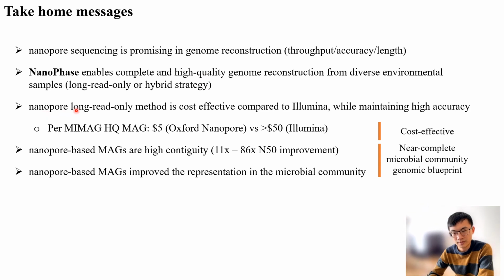Nanopore long-read-only methods have become cost-effective even compared to the traditional, widely used Illumina sequencing. We have seen the cost per high-quality MAG is already much cheaper than traditional methods.